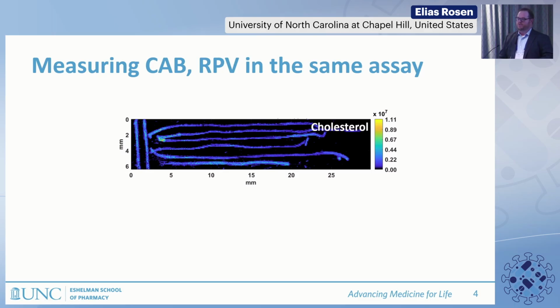We evaluate those strands alongside incubated quality control blank strands that are oriented vertically and horizontally during the acquisition. This map here shows cholesterol, which is ubiquitously present in all of these strands, just to give you an idea of where the strands are placed.